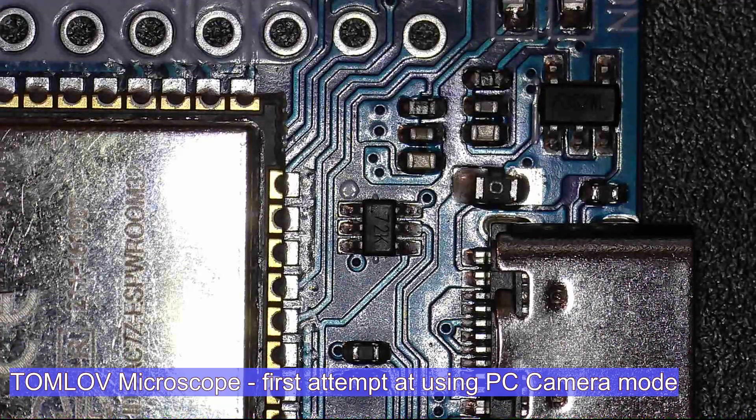This isn't going to be edited in any way. I'm using the Tomlove microscope — it's USB output, PC camera mode, straight into the USB on my PC. And then I'm using the free OBS Studio to record this. No editing at all.